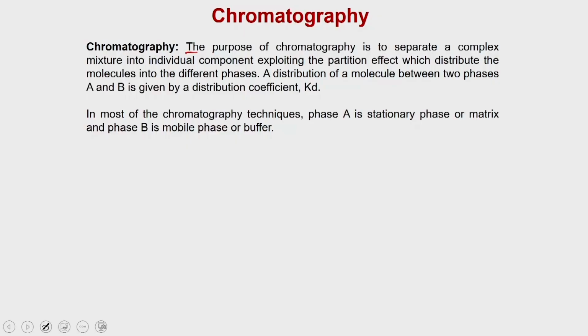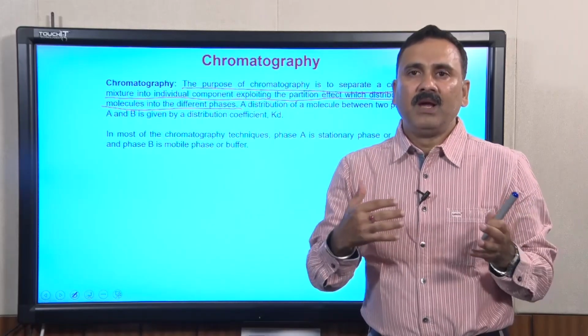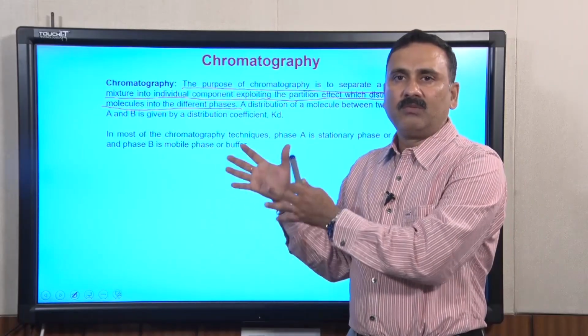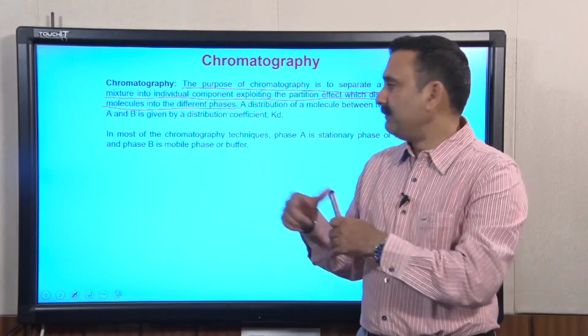The purpose of chromatography is to separate a complex mixture into its individual components, exploiting the partition effects which distribute the molecules into different phases. The basic principle of separation remains the same, except that the way in which you distribute the molecules into the two phases is different in chromatography compared to boiling point or melting point and all those other harsh processes.